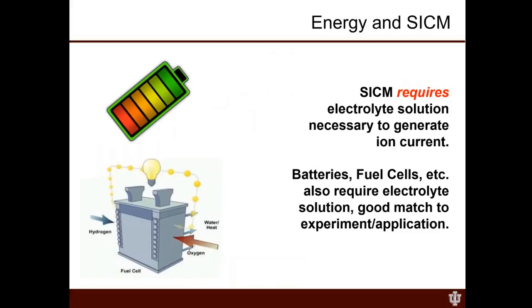Sometimes it might be a solid electrolyte, but often it's a liquid electrolyte that's required to generate the electrical power. That same electrolyte solution, SICM can often make use of. So there's a good match between the experiment and the application here. And this is turning out to be especially powerful, I think.